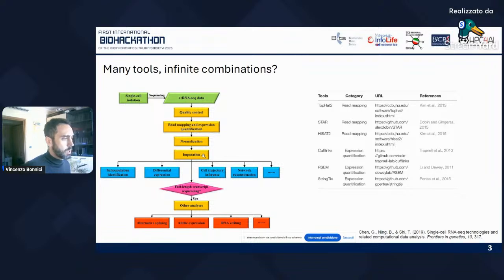Of course, it's very helpful if you just want to visualize your data, and it helps you a lot in this type of task. But for any other kind of analysis that we are going to do, especially for statistical analysis of your data, please be careful with this type of step.